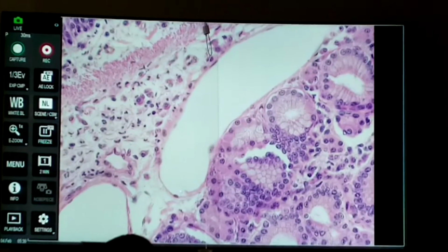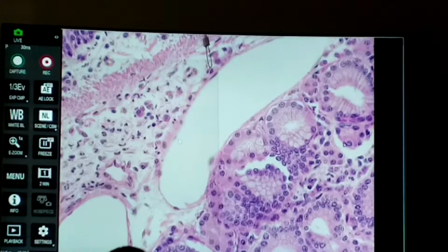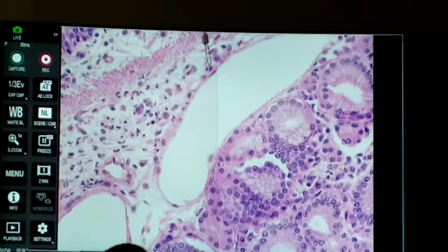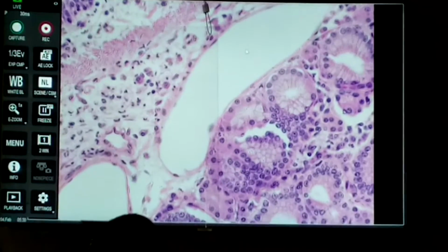Inside the line are appropriate. That cell. This one's faded. There's a cell. Here's a cell that's kind of squishy. Yeah, it's a blood vessel. Okay.